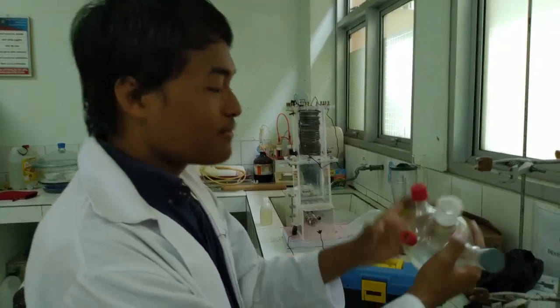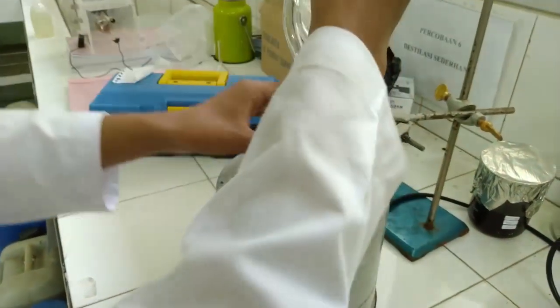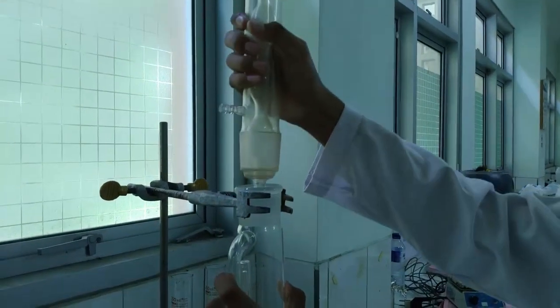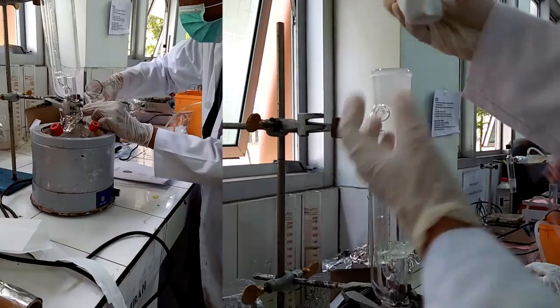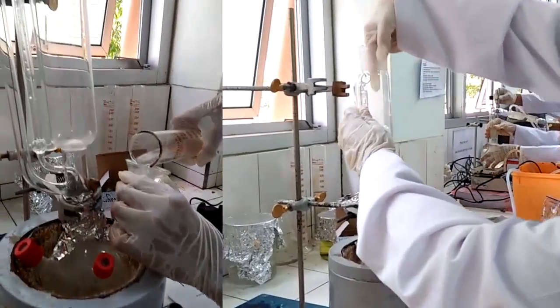Untuk merakit alat pada ekstraksi ini, yang pertama dimasukkan labu ke dalam heat mantle. Kemudian dihubungkan dengan tabung soklet dan dihubungkan lagi dengan kondensor pada bagian atas. Inilah tampilan dari rangkaian alat pada proses ekstraksi minyak atsiri.